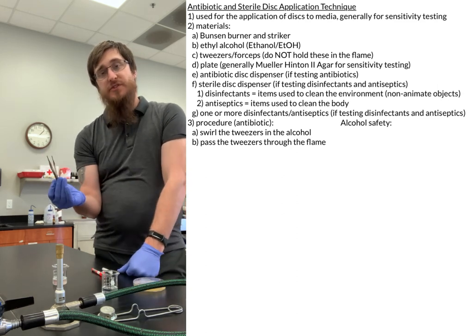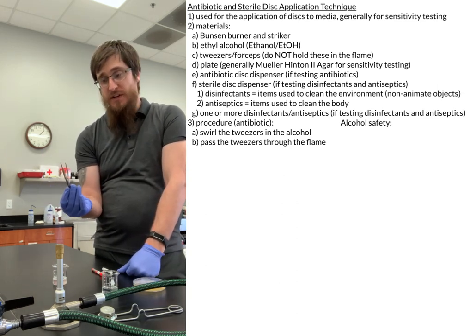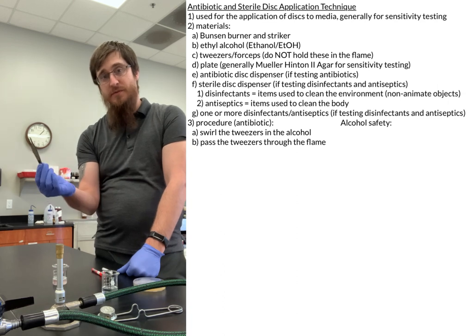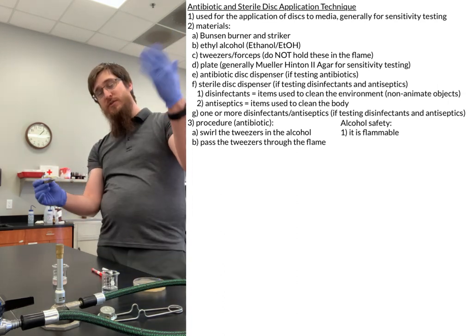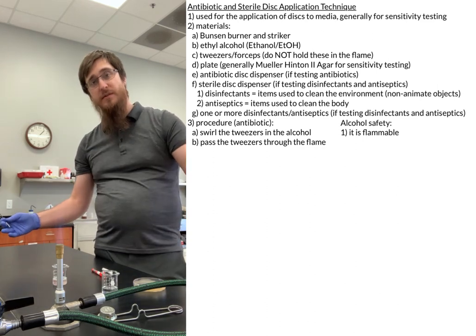Some other safety considerations that we have to worry about. Let's say that for some reason you pass it through the flame, you freak out, you put it into the beaker, now the beaker's on fire, you freak out some more, you knock it over, now your table's on fire.